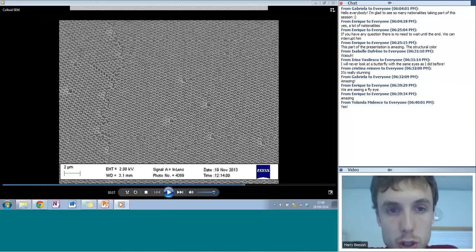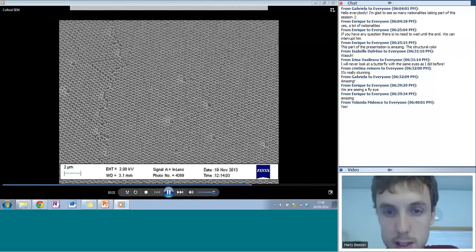And then also you can see, going down the left part of the screen, there's this jagged line where the pattern changes direction almost. That's an example of another feature common to all crystalline structures. It's like a domain boundary where you get different alignments of the pattern on either side of that line. So both of those defects will obviously be imperfections in the opal structure. But generally, you get fairly nicely arranged structures. So if we zoom in further, we can see the individual spheres more clearly.